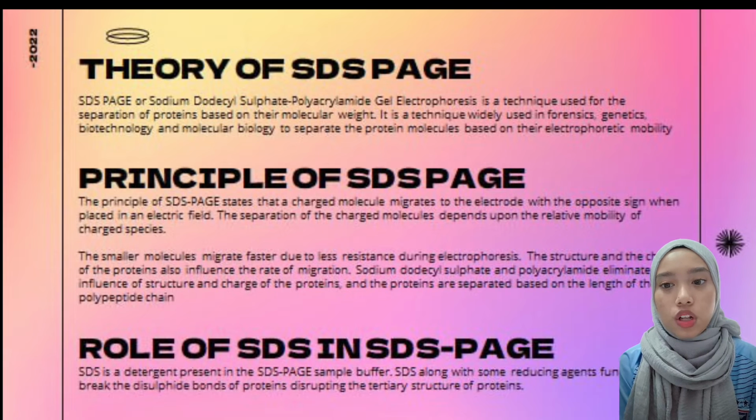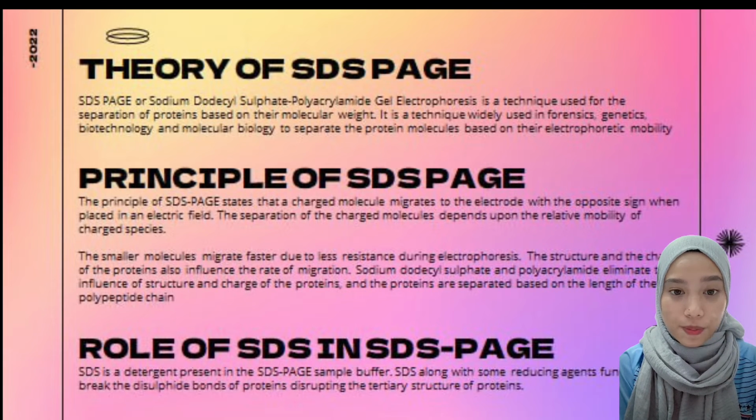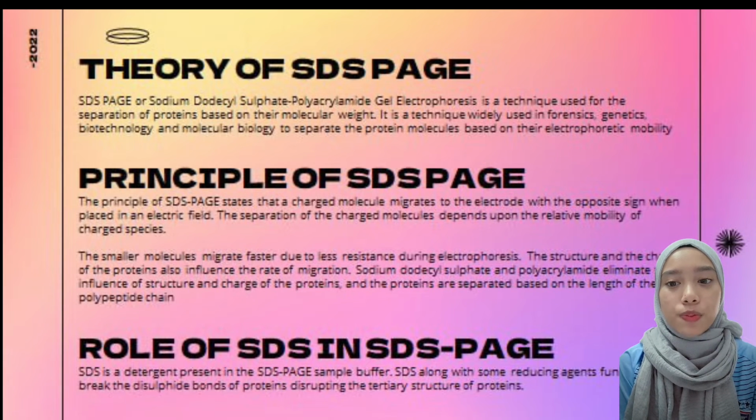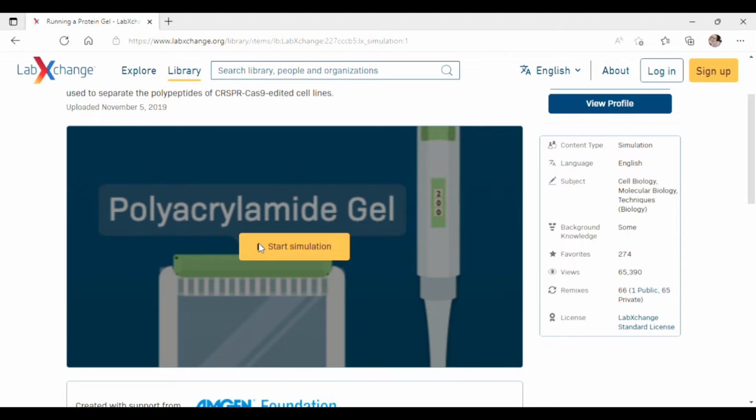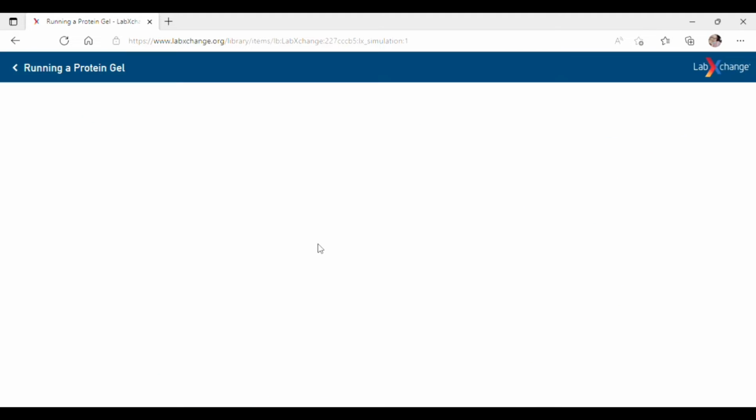Next is the role of SDS in SDS-PAGE. SDS is a detergent present in the SDS-PAGE sample buffer. SDS, along with some reducing agents, functions to break the disulfide bonds of proteins and disrupt the higher-order structure of proteins. So now, let's begin our experiment.